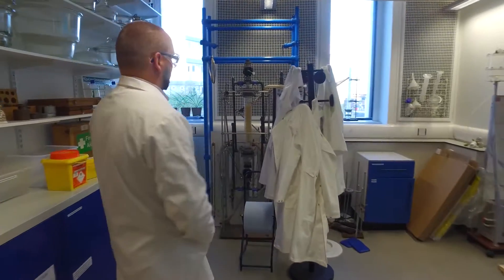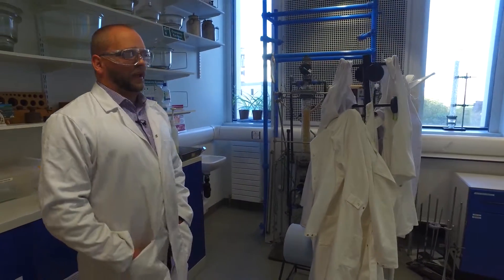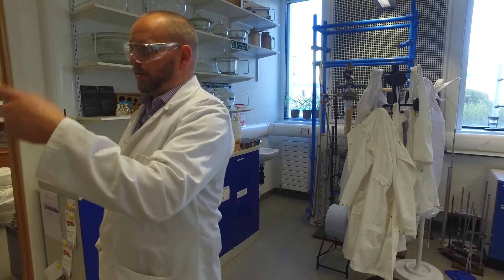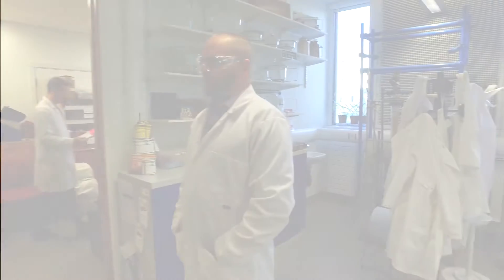A distillation rig. I think that's about it that's in here, but I'm going to take you over to some of the other experiments that we can do in other areas of the department.